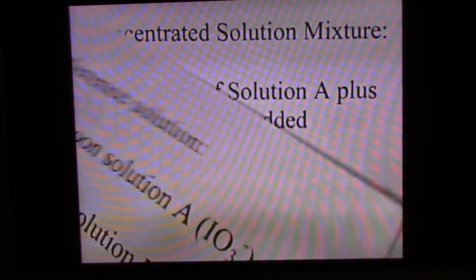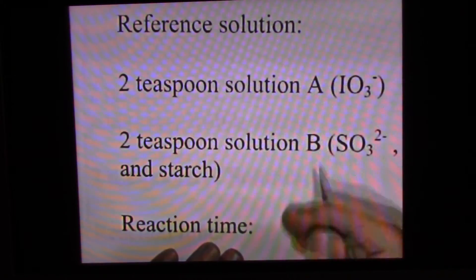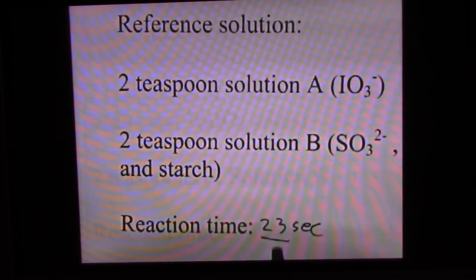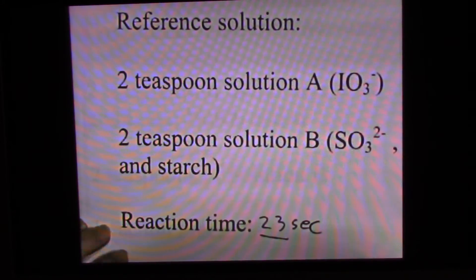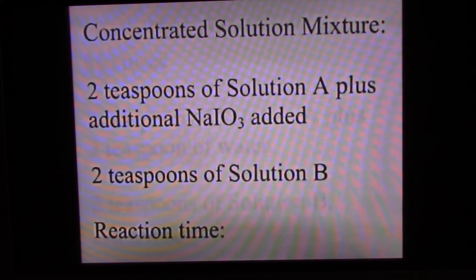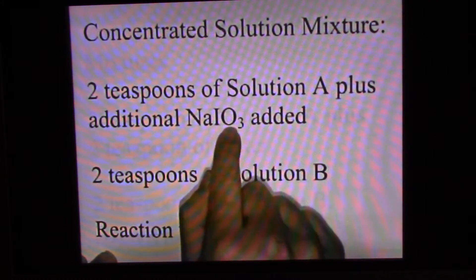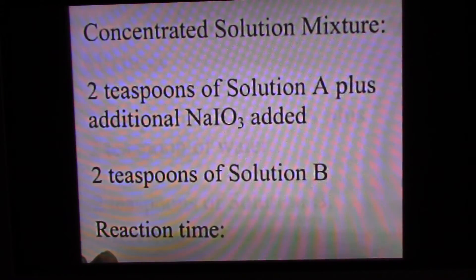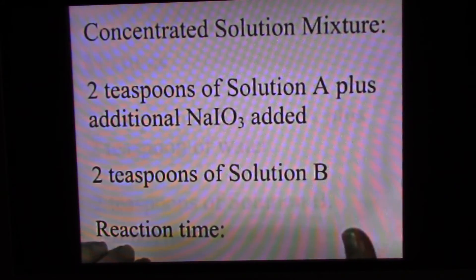Now we'll do things to change the rate of the reaction — we're going to slow it down and then speed it up. The next reaction uses a concentrated solution mixture with additional sodium iodate added to it, so it has a richer concentration of iodate. A more concentrated solution mixture means there's more reactant per volume; solution A has more iodate in it than normal.